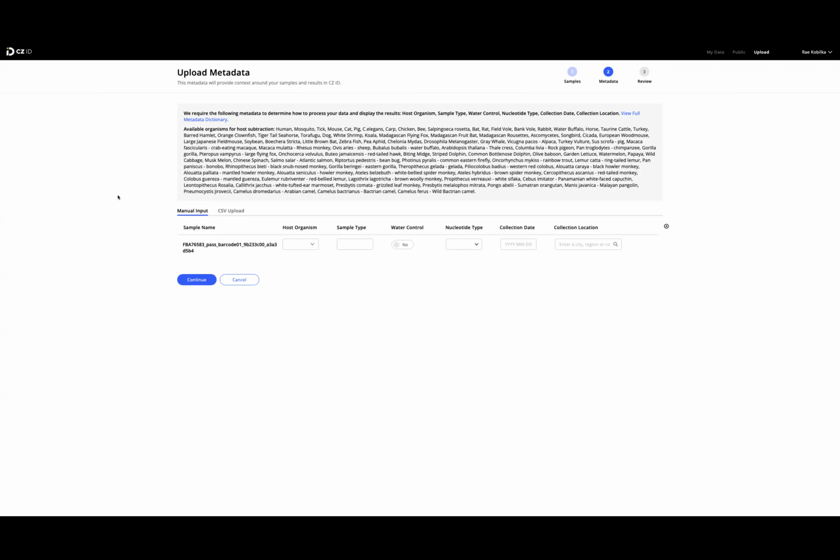which makes it really easy for us because we get the raw FASTQ files anyway. And when we go to the metadata part here, the initiative itself recommends to add as much data as possible. It depends on your needs.